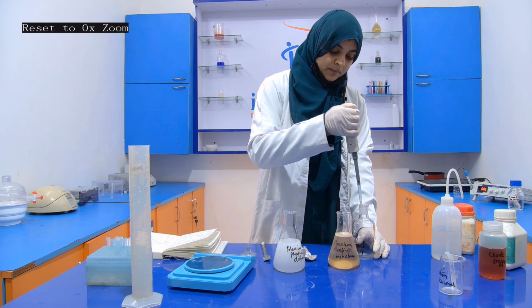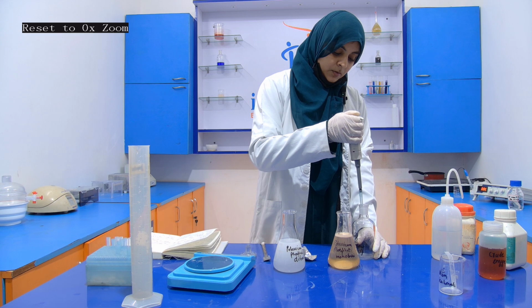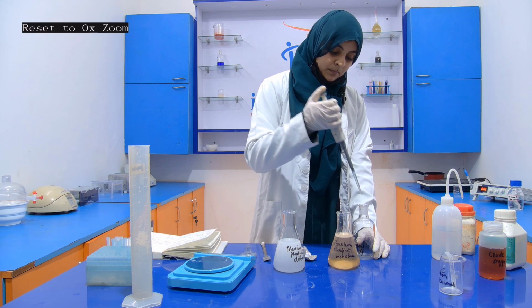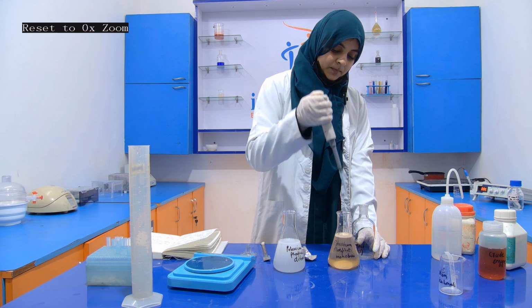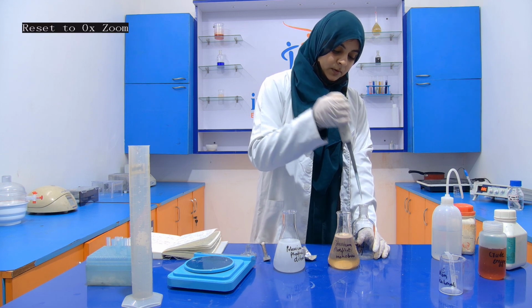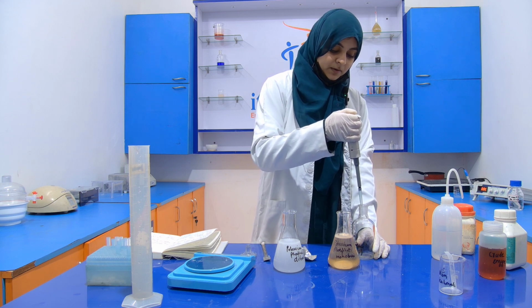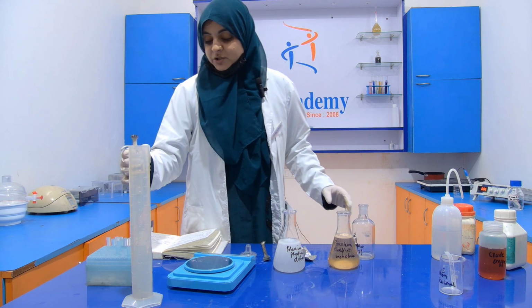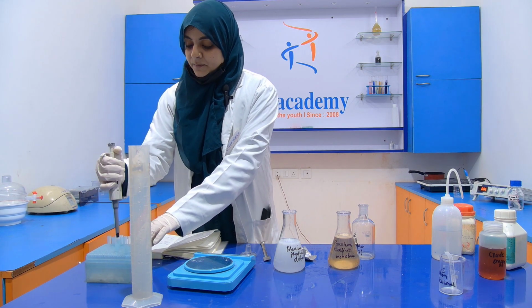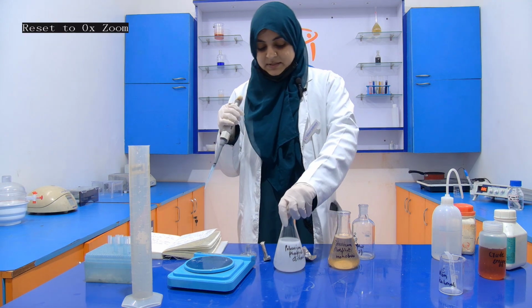1, 2, 3, 4, and 5. Then change the pipette and change the tip, and again I am going to take 5 ml of this dibasic.